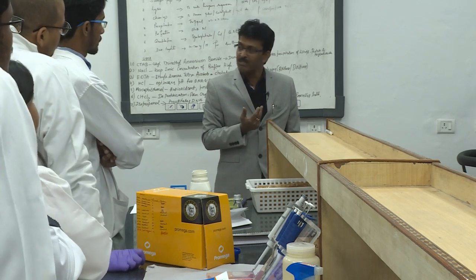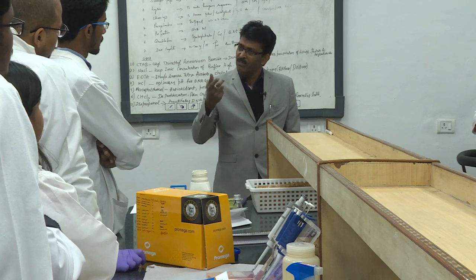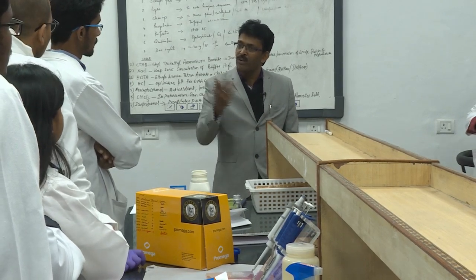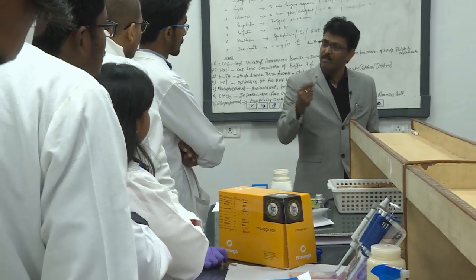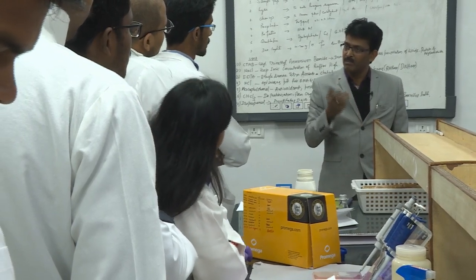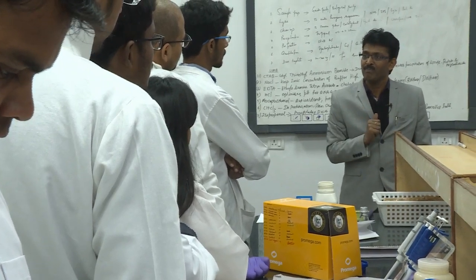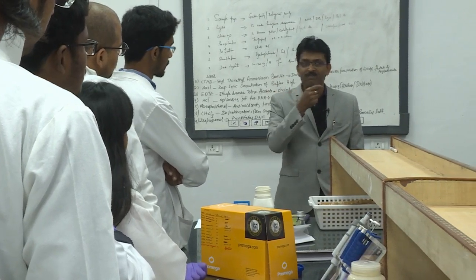5 to 6 days, and you just drop filter papers, I mean Whatman papers. You make a small disc out of it, and you go for autoclaving, right? Maybe you can soak it in sterile water a little bit, and you autoclave it. And the autoclaved, dry filter papers are spread on the petri plate, right? And the fungus is allowed to grow for another 2 more days, right? And after the 7th day, you start picking those filters.